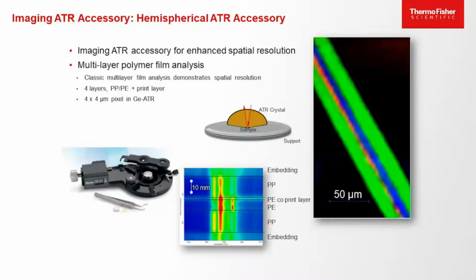The entire sample there is about 50 microns in size. The advantage of the imaging tool that's used here, this ATR accessory, as I said, is you don't come out of contact with the sample.